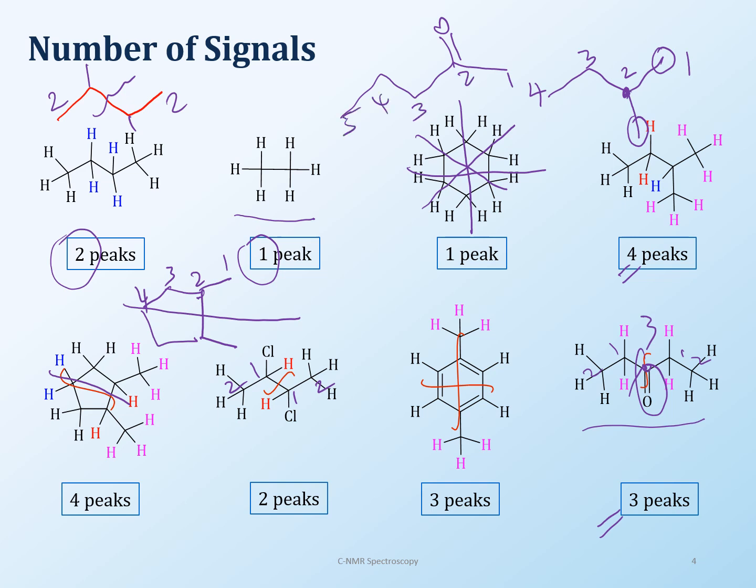Anyhow, I just wanted to remind you not to forget that this is carbon and not proton. So you count the carbonyl carbon as well.